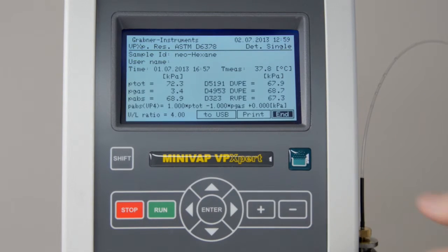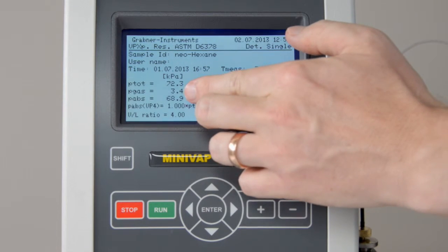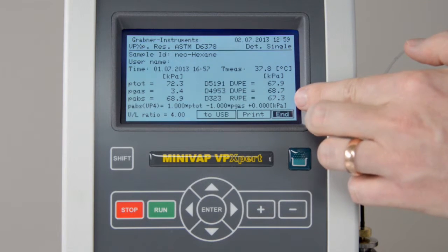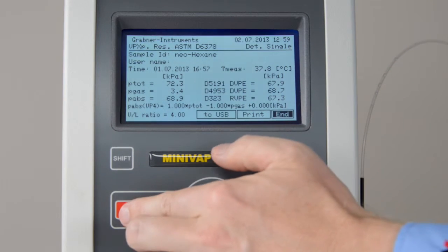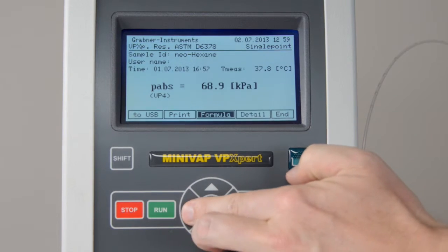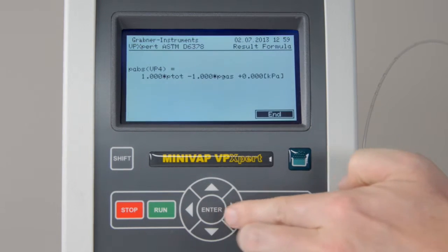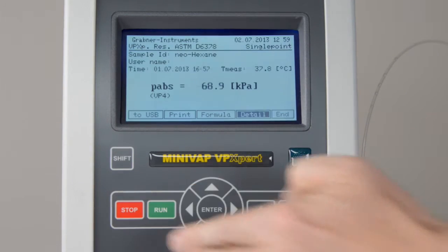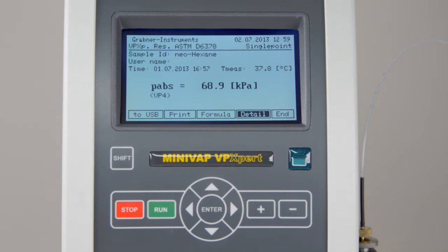Record the absolute vapor pressure. Go into Details for additional results. Press Stop to go to the previous menu. Click on Formula to check that the absolute vapor pressure is the total vapor pressure of the sample minus the vapor pressure of the gas.